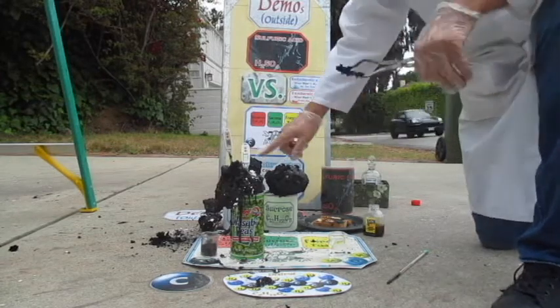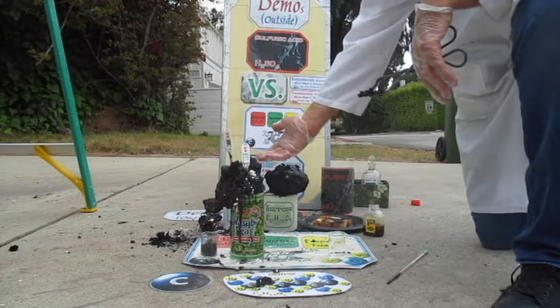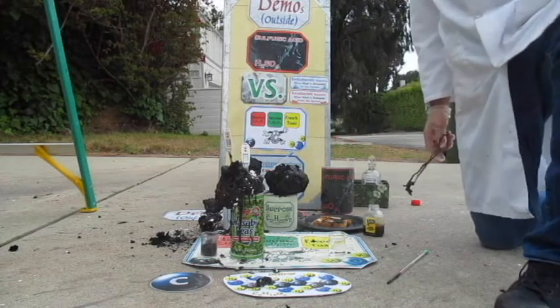Okay, and now it's getting to 138, so it's actually pretty similar. This one got to, what, 147, I think? And this one's getting, right now it's almost at 140. Let me see what the maximum temperature is. Let's just film till we get a maximum temperature on this.